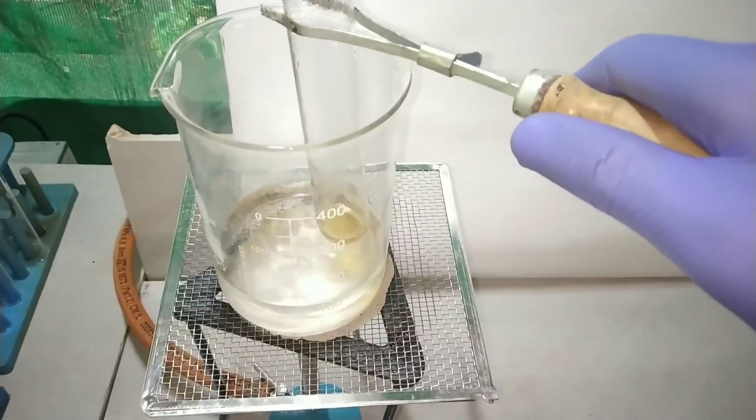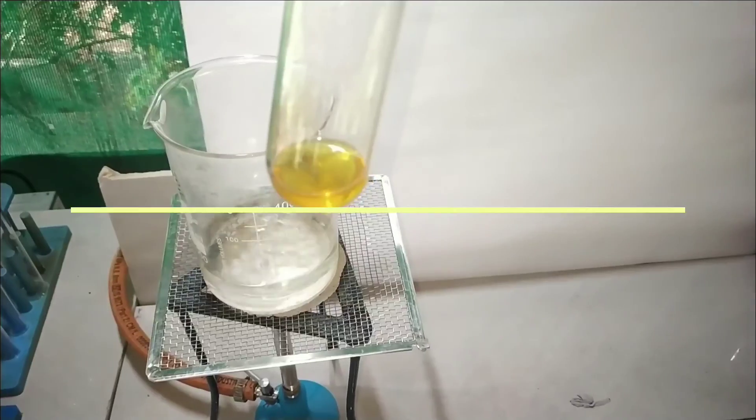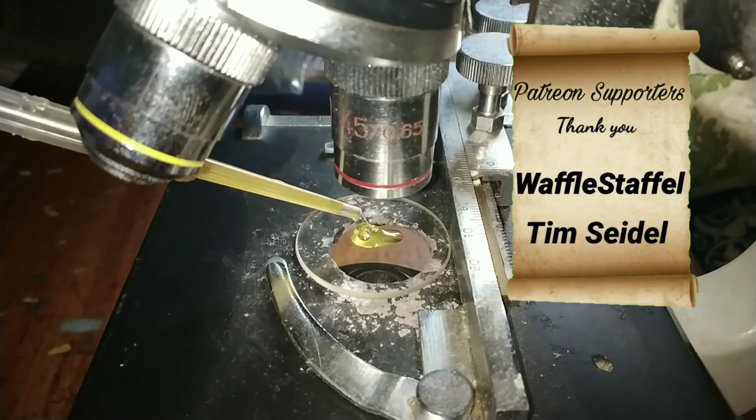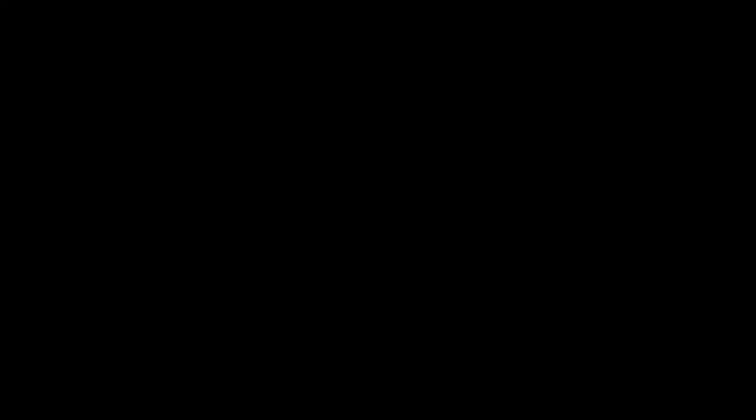Now we are back to the reaction. After 30 minutes we take it off from the boiling water bath and cool it under running tap water. We then observe the crystals formed under a microscope in high power field.